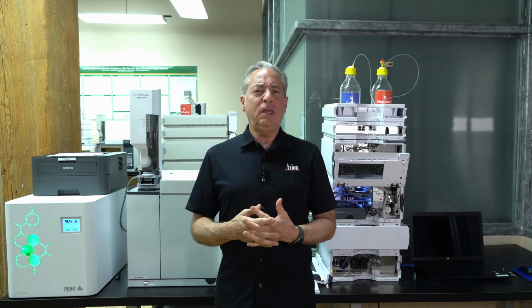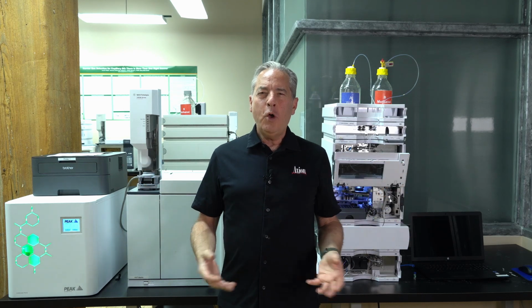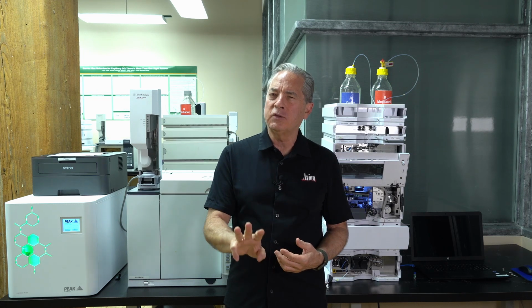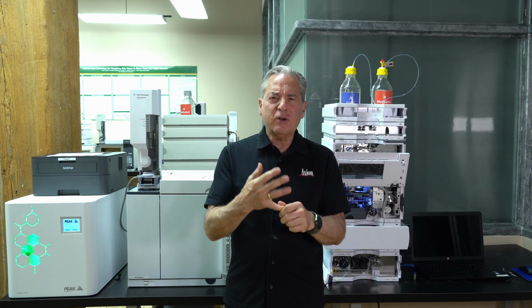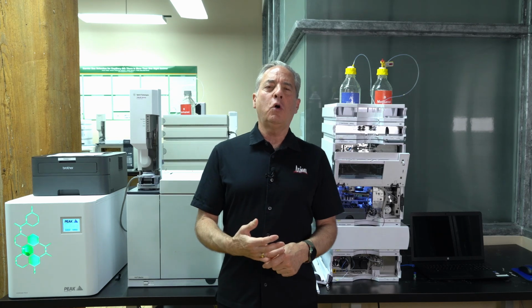Now in HPLC, it's going to be the same answer. Because in HPLC, just like GC, it's the exact same technique. We have the same resolution equation, which means there's still only three things that affect resolution in LC: capacity, selectivity, efficiency. Capacity factor in LC is all about solvent strength. So you need to weaken your mobile phase. If your capacity factor is too low, you weaken the mobile phase.